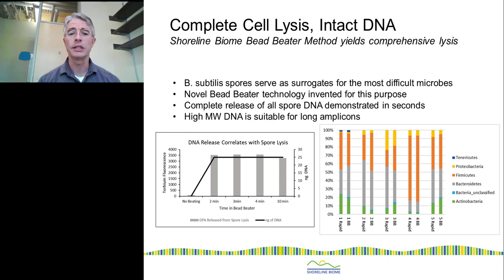He's been cracking spores for years. Essentially, we came up with a mechanical method for treating cells that would crack the spores but not harm the DNA. It's a unique little machine that has quite a unique action to it. We've applied for a patent on it, but essentially what we can do is, in just a few seconds, crack open spores. And if we get spores, then we get every other vegetative cell, or so we think.